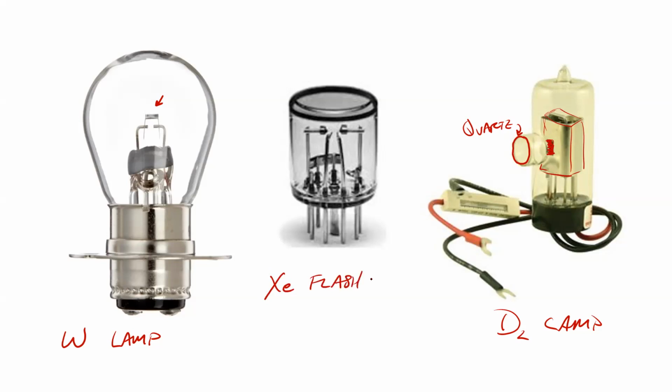I had a 50-50 chance, darn it. So LEDs tend to be solid state. That is, they don't require any glass. They don't have to contain anything because it's just a single little electronic component that happens to emit light.